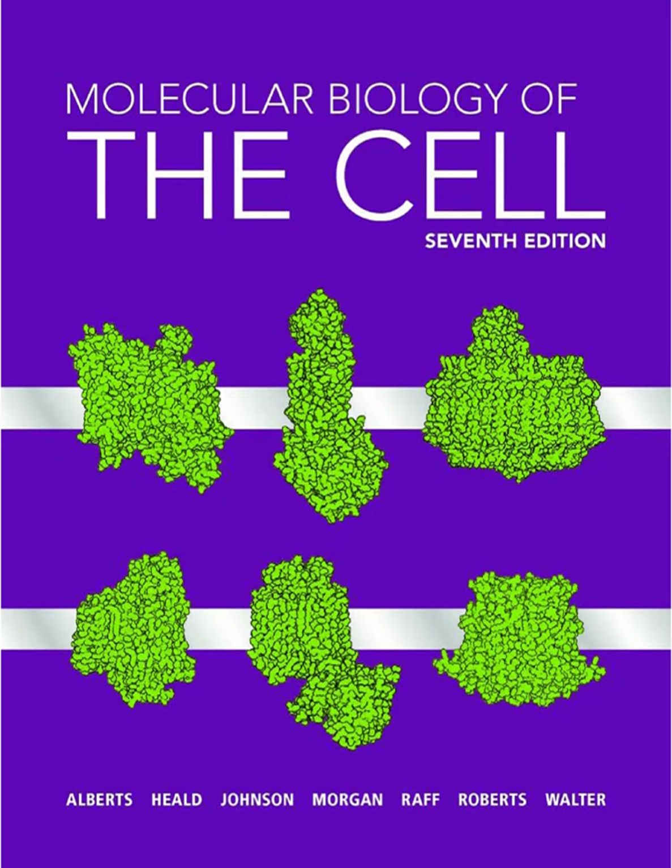Instead of illuminating the whole field of view, it uses a focused laser beam to illuminate only a single tiny spot in the specimen at a specific depth. Okay, just one point at a time. Right, and then crucially, there's a confocal pinhole aperture placed in front of the detector. This pinhole is positioned so that only light coming from that illuminated focal spot can pass through to the detector.